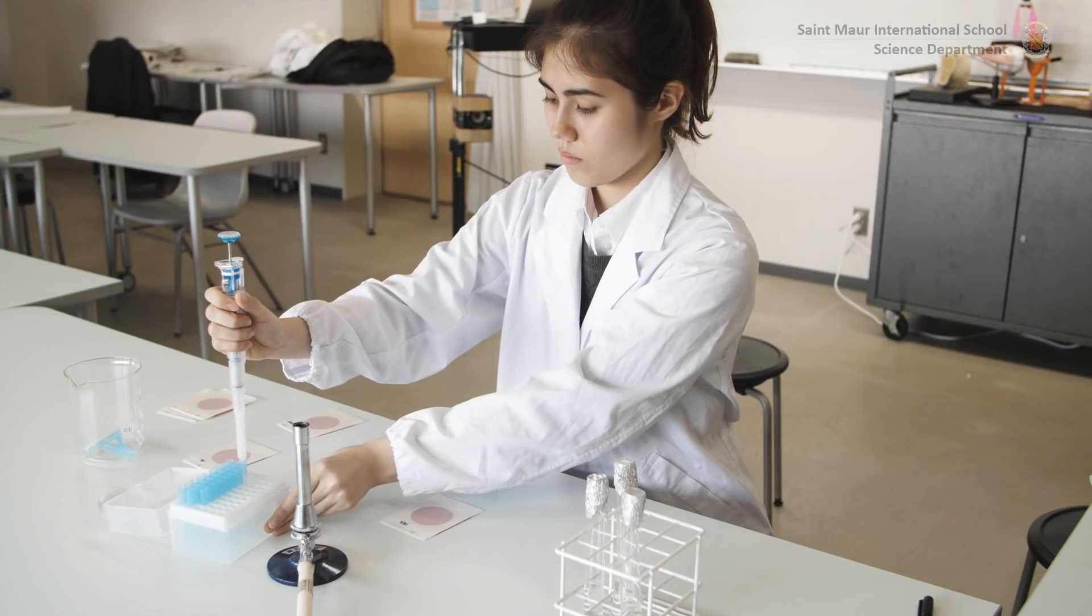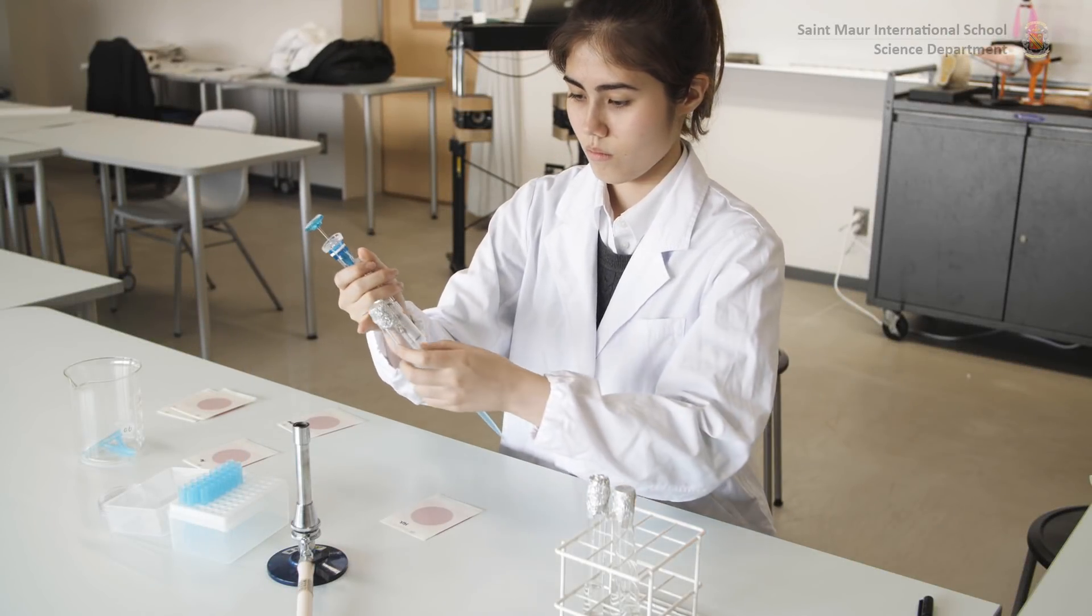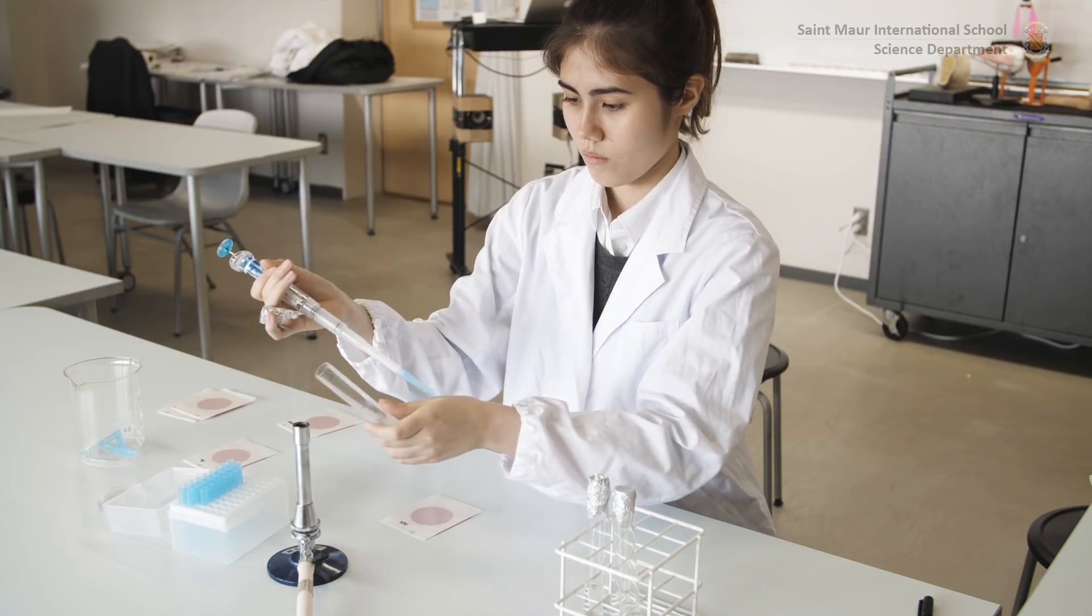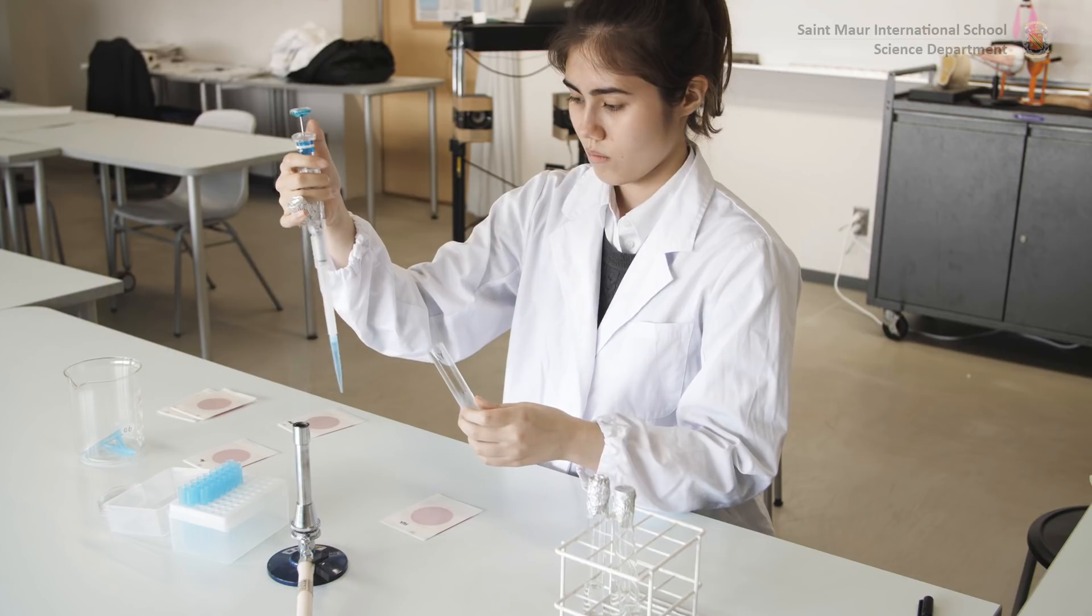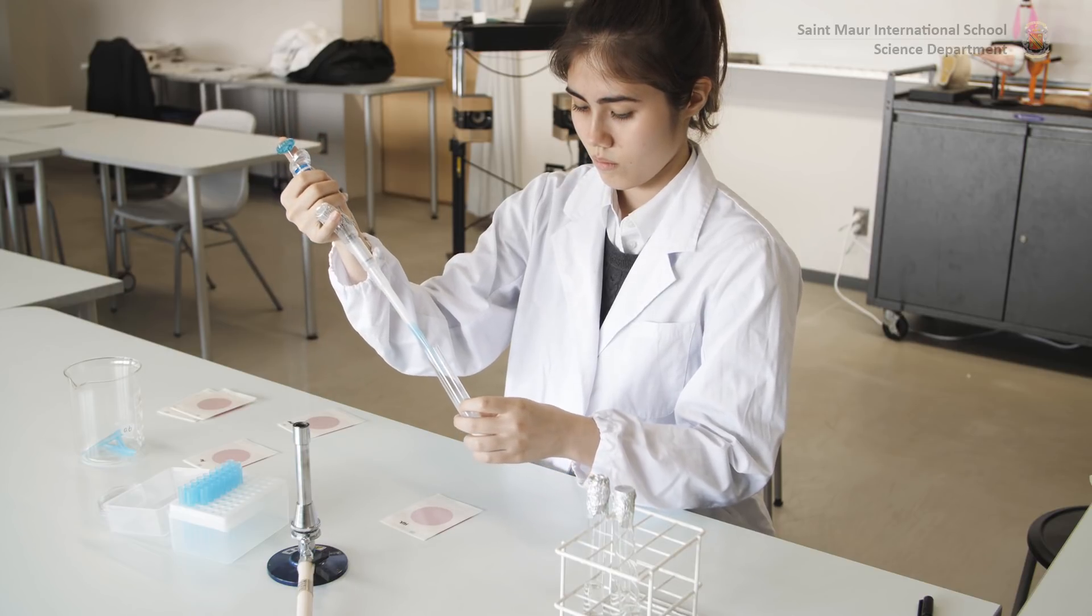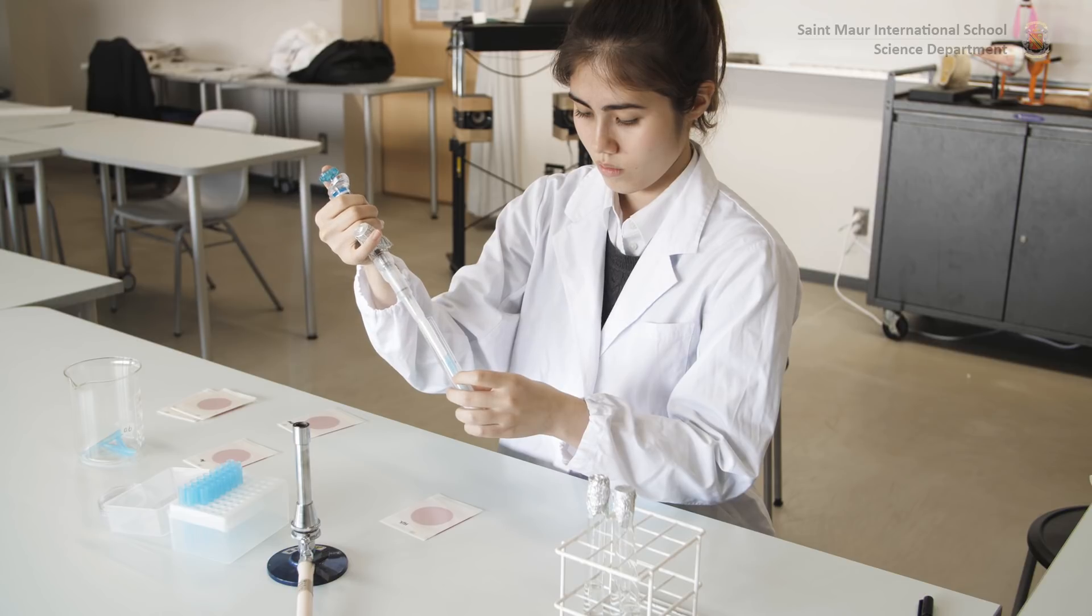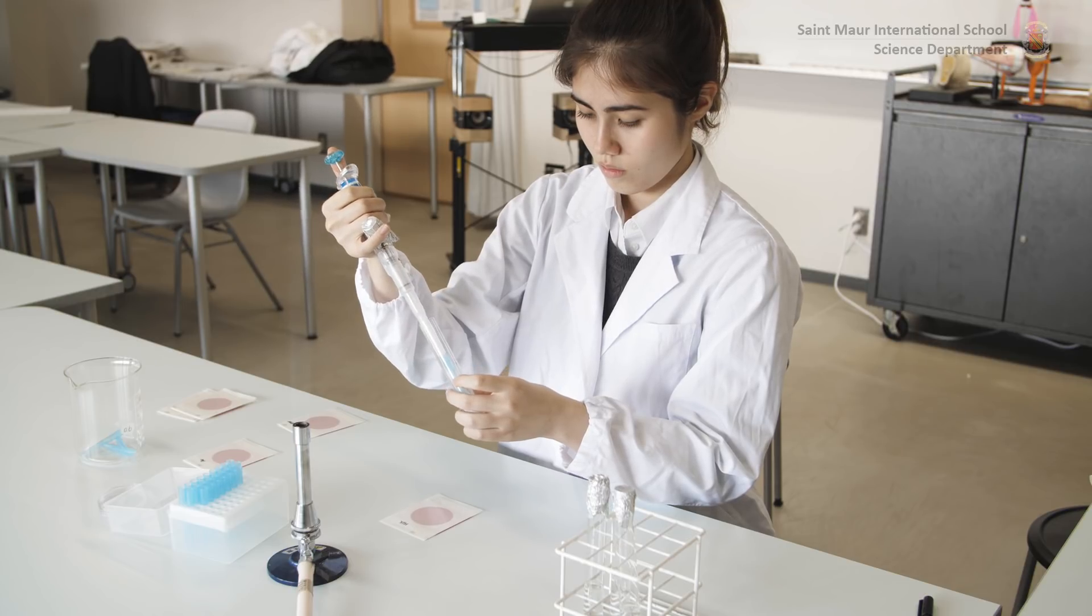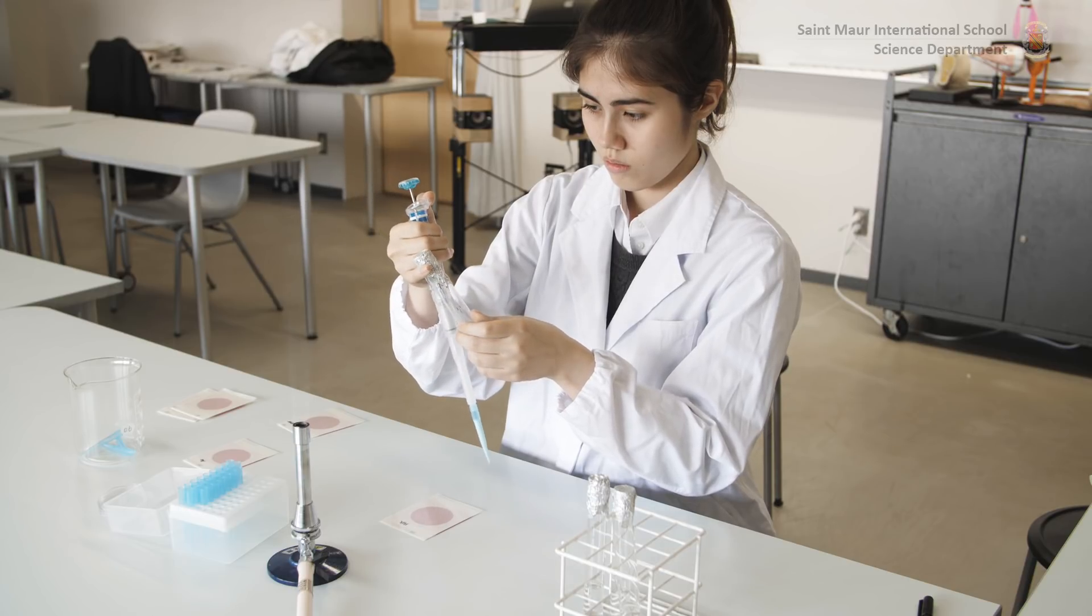Microbial load estimation in liquid samples: The 3M Petrifilm plate system is used in many microbiology-related industries and fields to culture various microorganisms. They are designed to be a faster, more efficient method for detection and enumeration compared to conventional plating techniques.